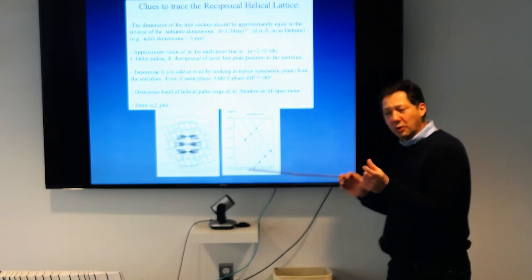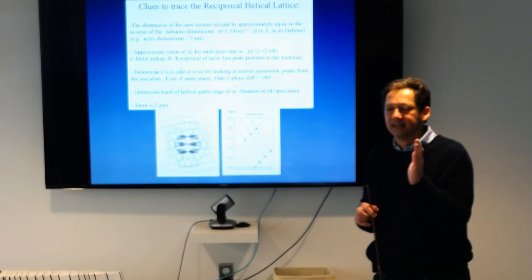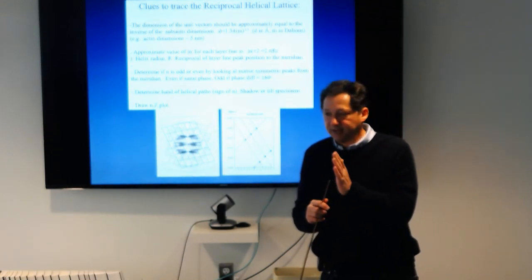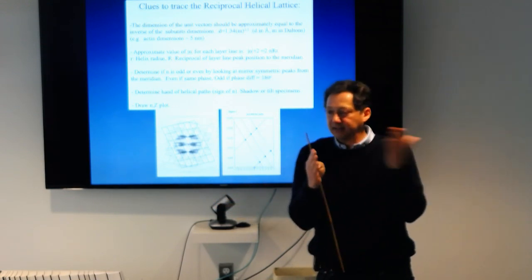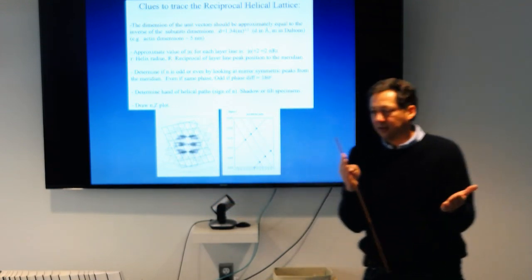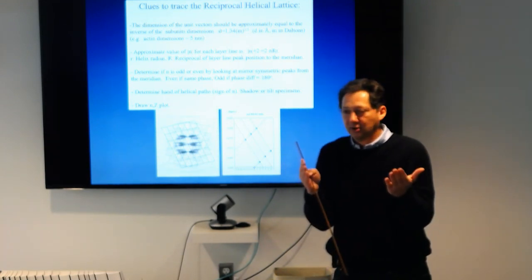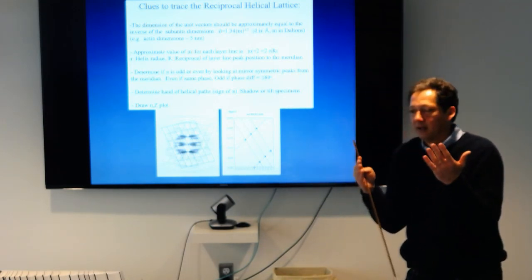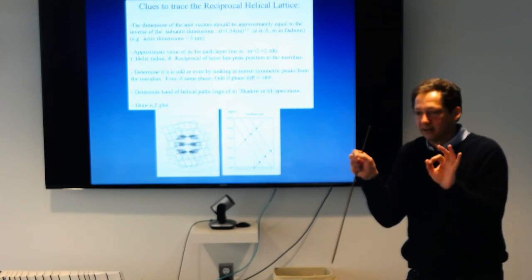Another, simpler way to see it is when you see a helix, you check if the helix is centrosymmetric, right? That means this side is identical to this side. Well, that's an even case. So the layer lines are probably going to be even because that's a centrosymmetric structure.